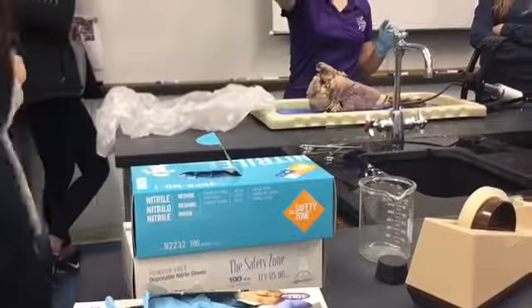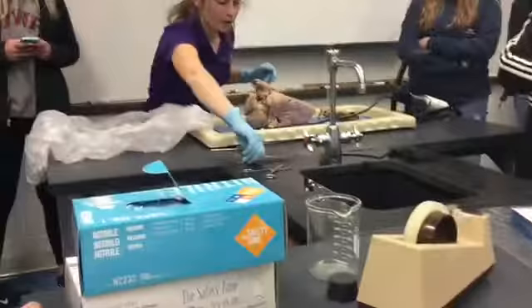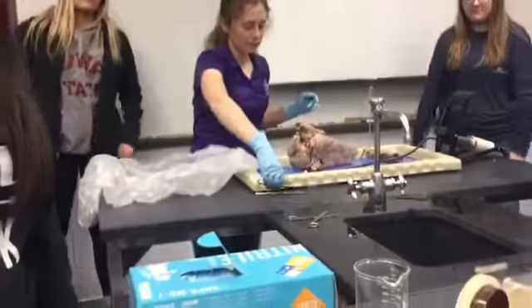Materials you need. You need gloves if you're gonna touch it. There are small and mediums up here, and large gloves in the back. It's not perfectly washed. You will need one blunt probe and one pair of scissors per group, and you'll need a dissecting tray. Grab your materials, and then I will eventually bring around your phone.